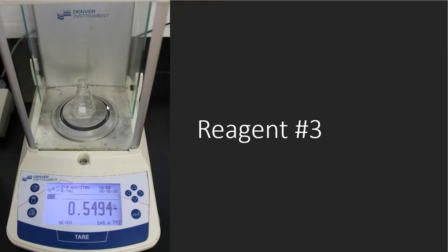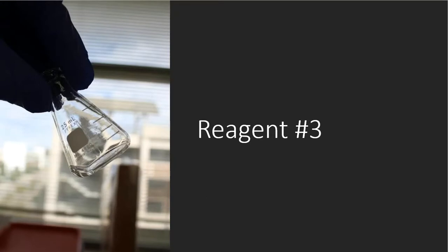Acetanilide, methyl p-Hydroxybenzoate, and then regular methyl benzoate. All right, so there we go, folks. There it is. So reagent number 3, if I want to give you a better picture of it, this is about as good as I can get. It was a very clear liquid. It did have an odor, and it smelled like one of those kind of chemical residue remover type of solvents that you would get at Walmart or Lowe's or Home Depot or another big box store. So there is reagent number 3 with my methyl.